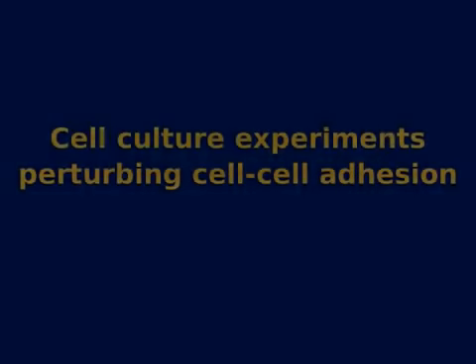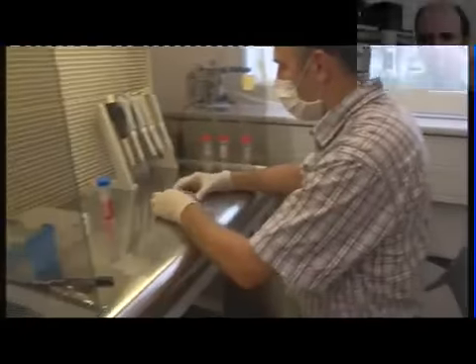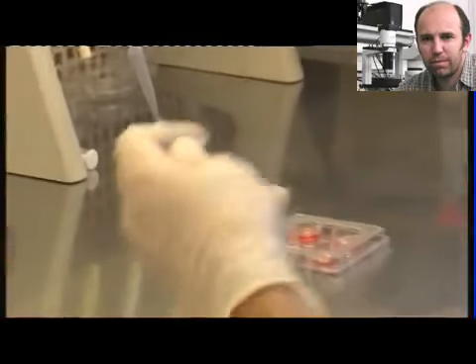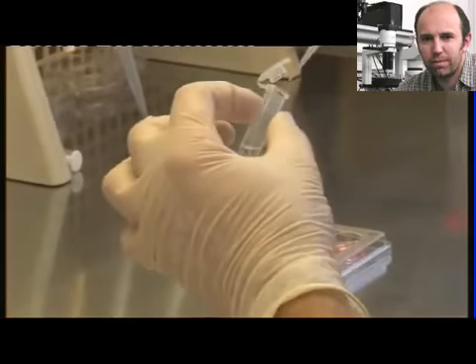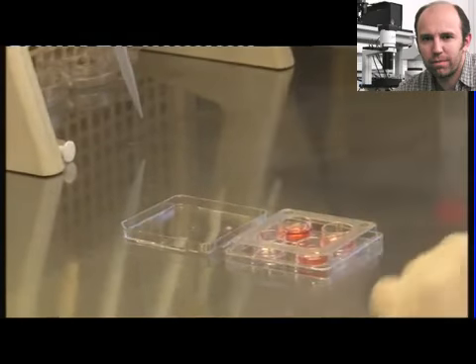To understand how such cells can organize their movement, we performed an experiment with cell cultures. Cells were grown on a rigid plastic tissue culture substrate and seeded in patches in which the cell density was very high. We used an immortalized human keratinocyte cell line named HaCaT, which we could easily culture and manipulate in a standard cell culture lab.